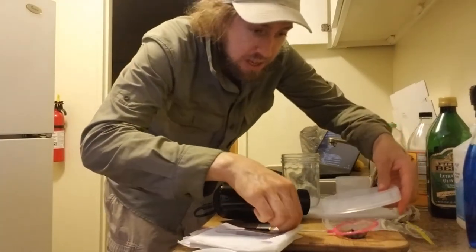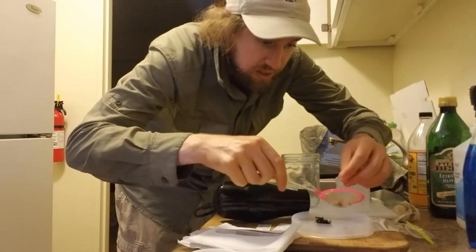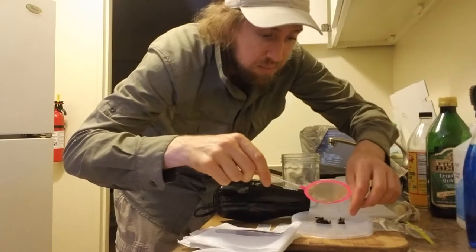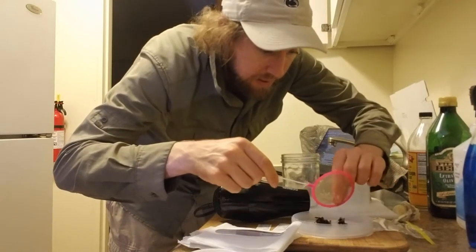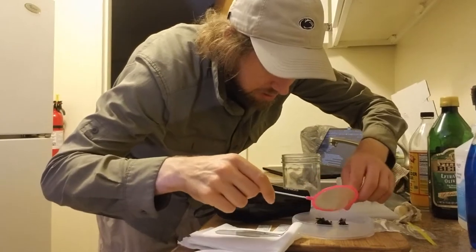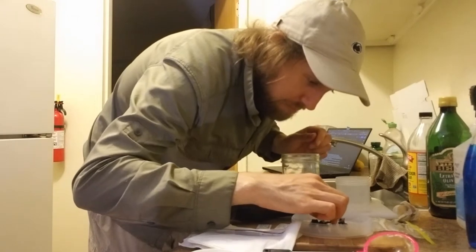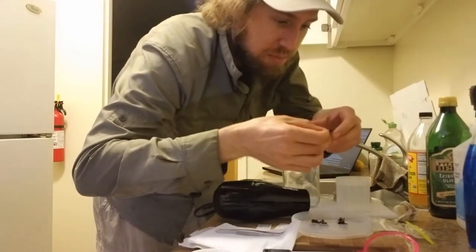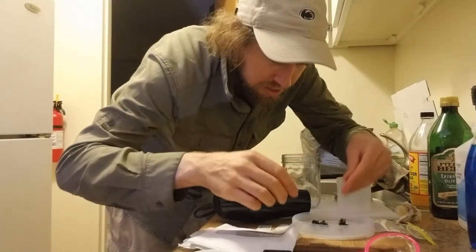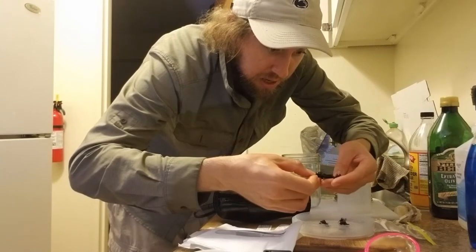These big petri dishes can be kind of helpful just because they give you a space to look at all your specimens. Now because I collected these with the net they're going to be mostly bees, though I think there are a couple of other things in here. There are a couple of wasps that I'm pretty sure are wasps, but I'm actually just going to include them in this washing process because I haven't looked at them closely and I'm not super positive.